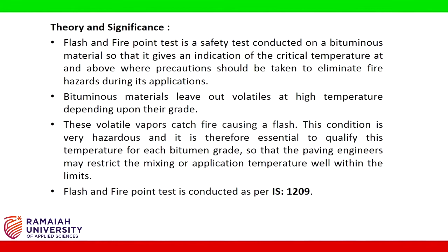Bituminous materials leave out volatiles at high temperature depending upon their grade. These volatile vapors catch fire, causing a flash. This condition is very hazardous, and it is therefore essential to qualify this temperature for each bitumen grade so that the paving engineers may restrict the mixing or application temperature well within the limits.